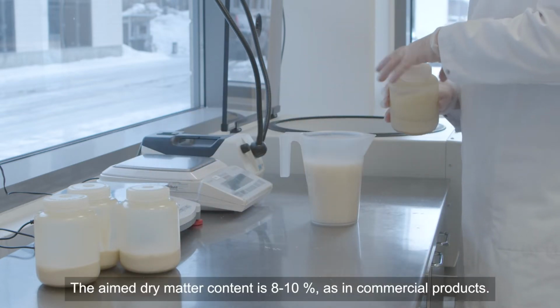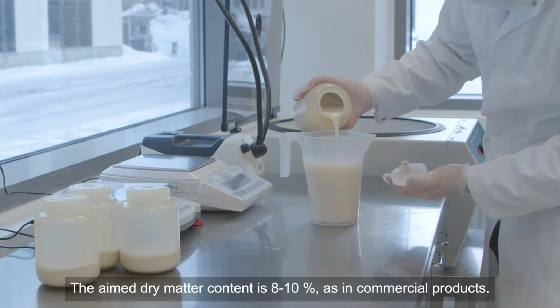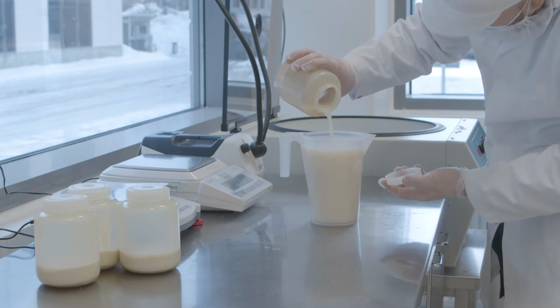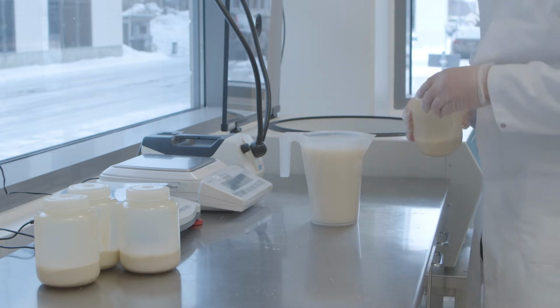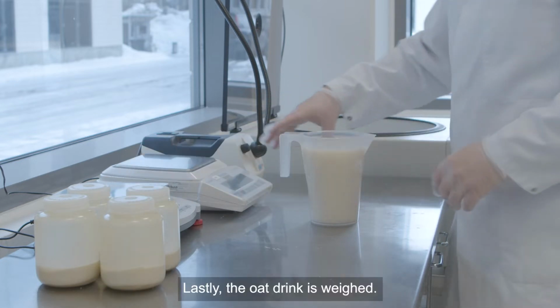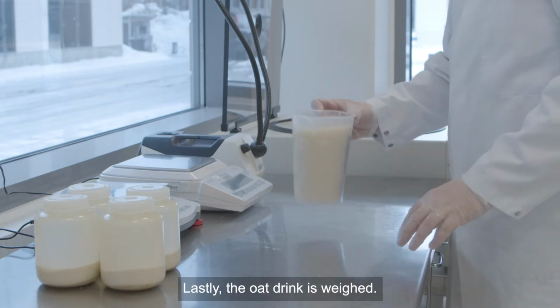The aimed dry matter content is 8 to 10%, as in commercial products. Lastly, the oat drink is weighed.